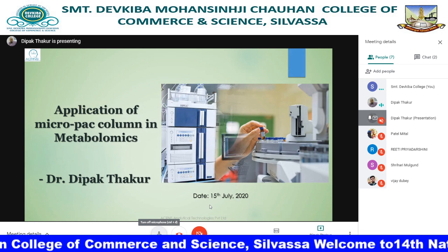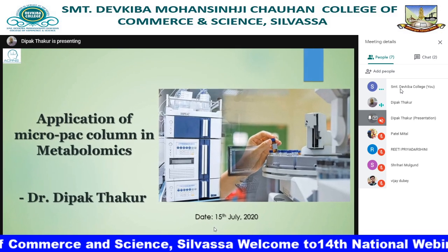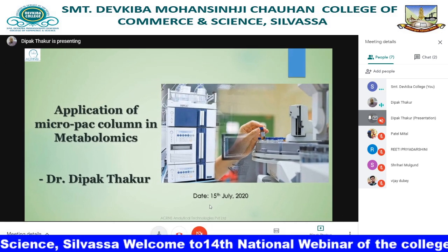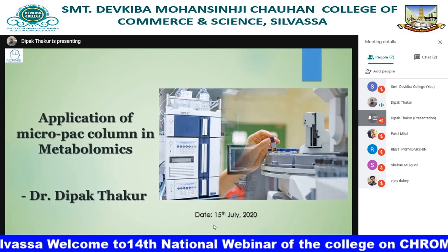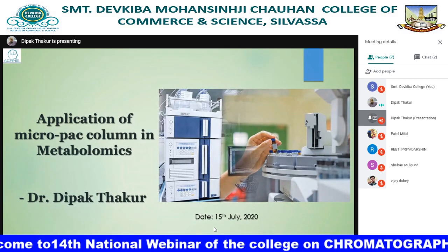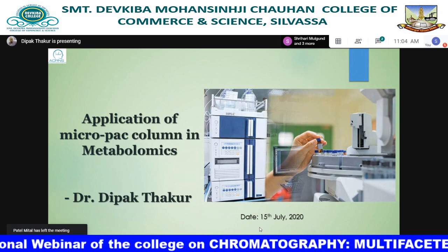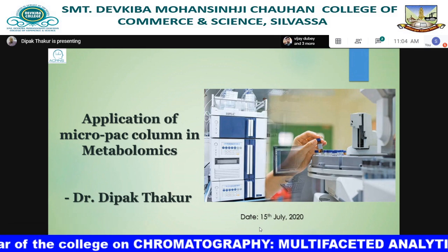We yesterday spoke about chromatography, how the invention of column chromatography happened, what are the basic principles involved in chromatographic separation, and after that we looked at different components involved in HPLC machine, what are their roles, right from solvent reservoir to degasser to pumps, then injector, column, and detector.